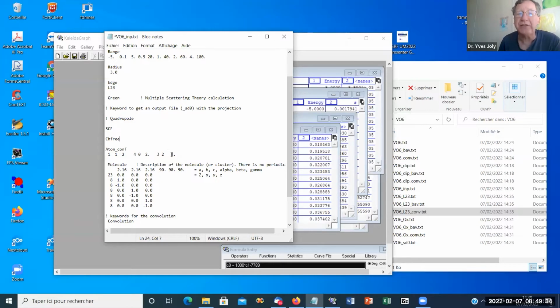And in that case, if it's 3 plus, I would write like here 3d 2. So it appears like it's 1 plus, but in practice, it is what gives the best result. So it's just pragmatic. I have often questions about that, and it's my rule of thumb, I would say.